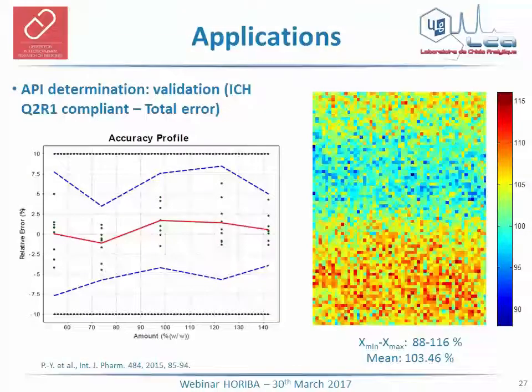Its analytical performances were determined based on a total error and risk-based approach using the accuracy profile as decision tool. The quantitative regression PLS model has been fully validated within the plus-minus 10% acceptance limits. The classical plus-minus 5% acceptance limits for the assay of pharmaceutical product were not achievable because of sampling issues.